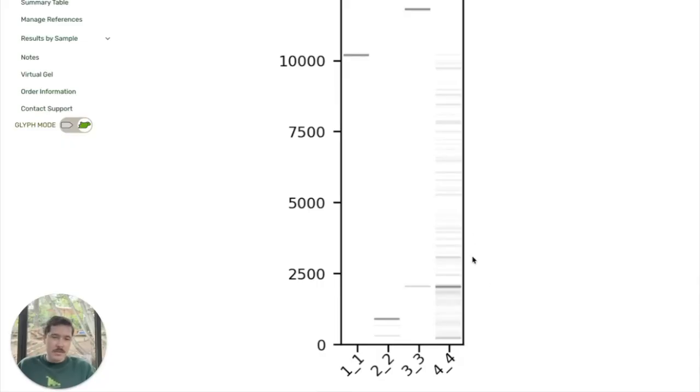And so this might reflect a lot of off-target PCR amplification that you would definitely want to know about, and you may be able to refine this into a few tighter bands with some careful primer design.